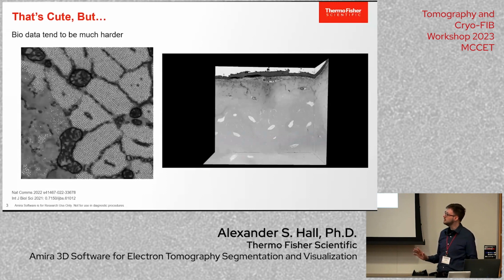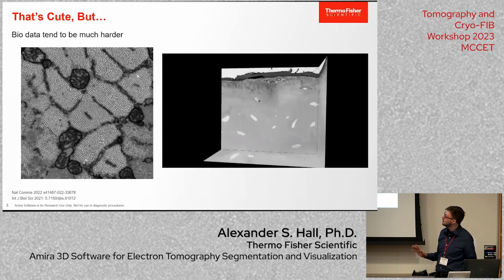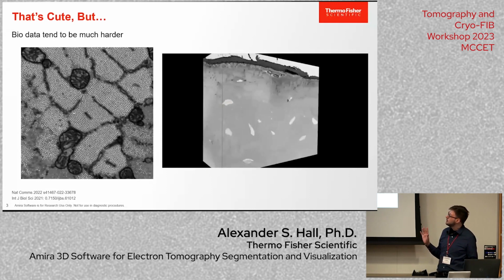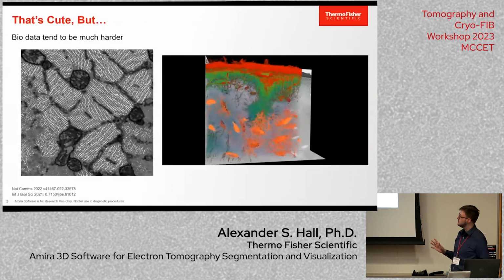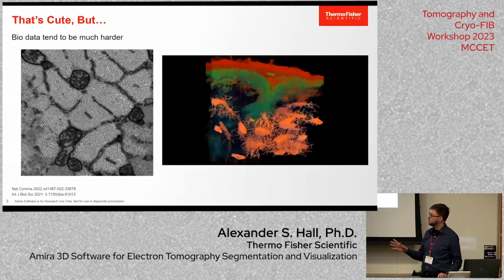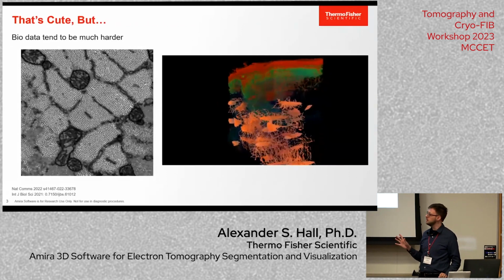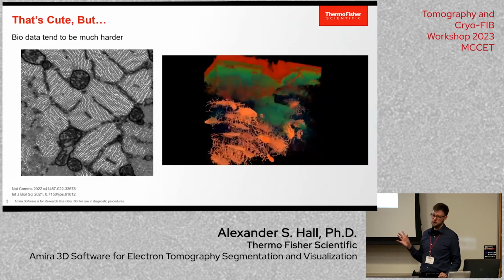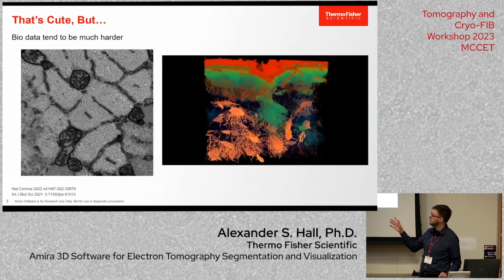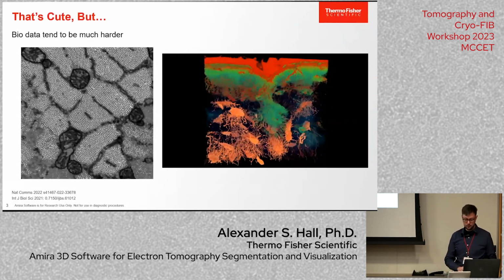So on the left, this animation is probably not playing so well, but these are both volumetric electron microscope image data sets that I've worked with. On the left is a focused ion beam SEM image of heart cell tissue. And on the right, we have bone tissue. So these are osteocytes that live within what are called lacunae. It's a pretty large field of view.